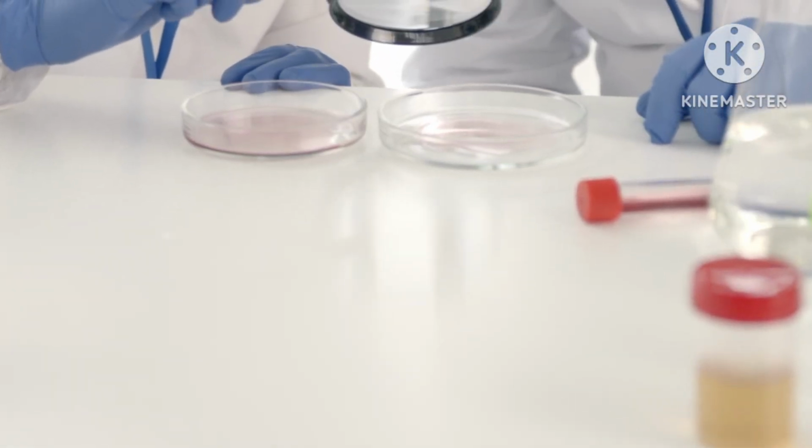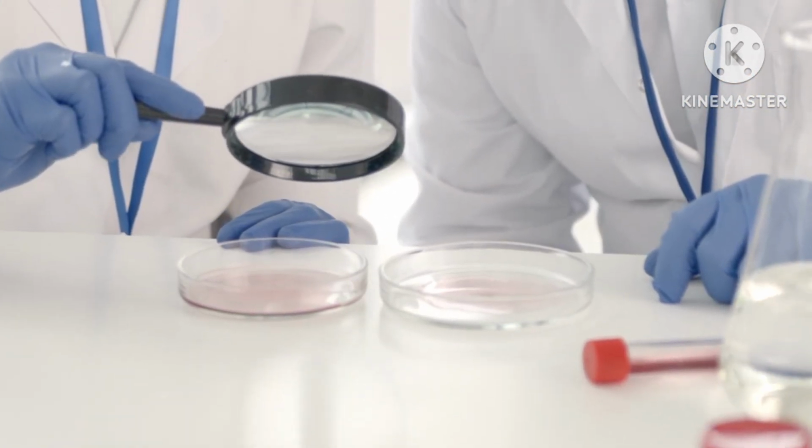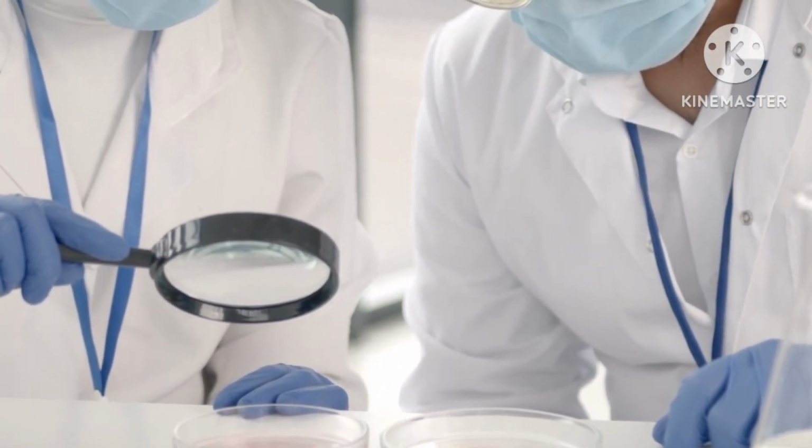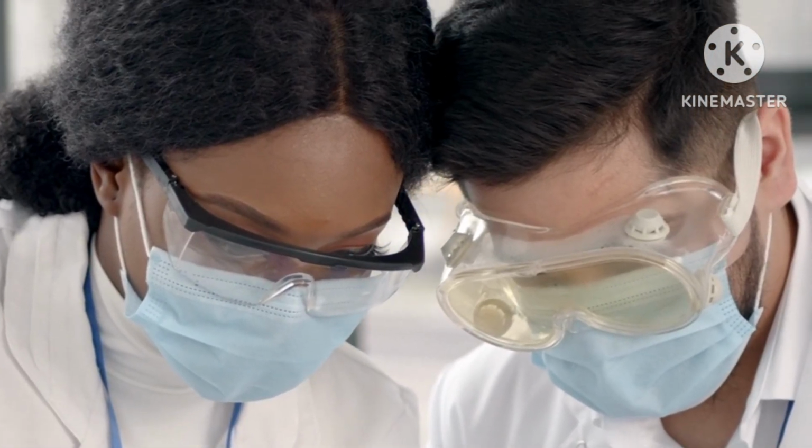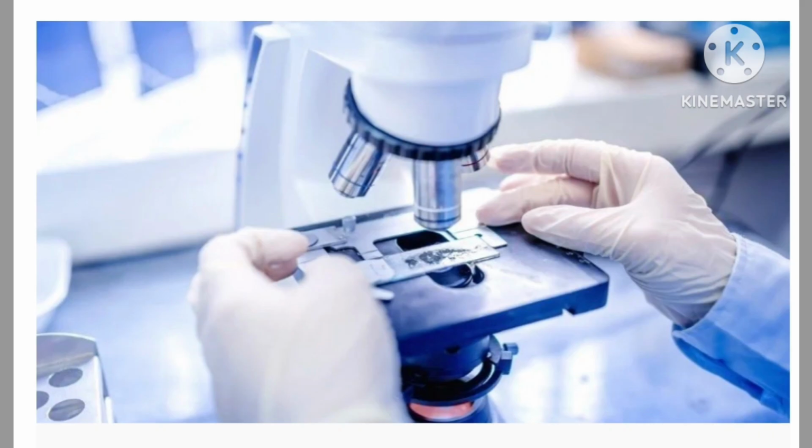Now, let's connect this to medical laboratory technology. As MLT students, you are not learning the microscope just as a theory topic. You are learning one of the most important practical tools used in different sections of the laboratory. Let's see where it is used.